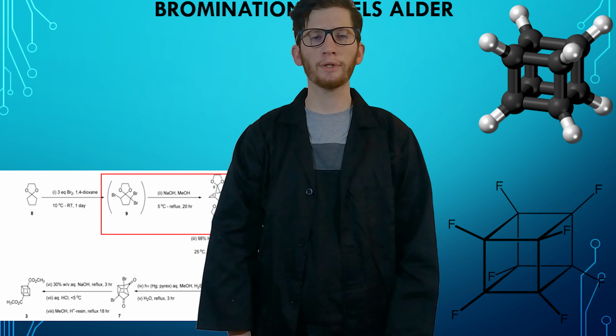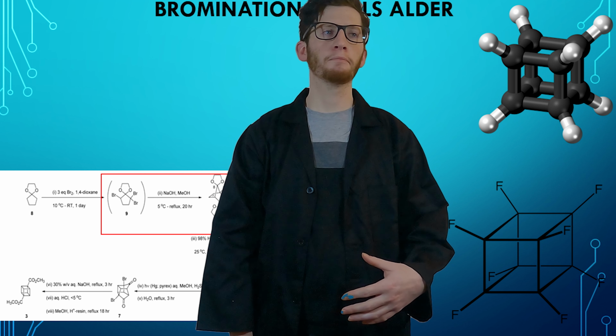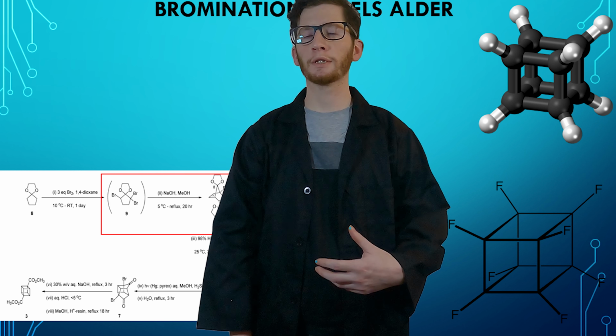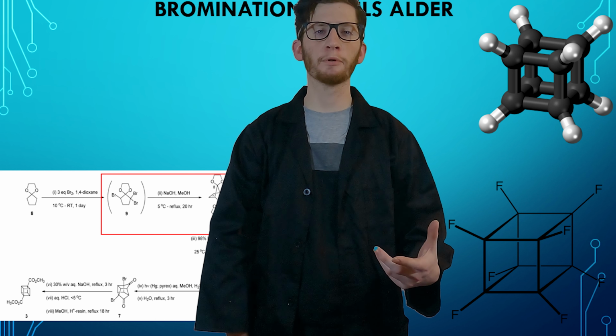So this is where we're going to deviate from publicly available synthesis, the information that's currently out there, what other people are doing. We're going to be deviating from that. We're actually going to be doing the bromination and Diels-Alder step in one. However, it is a 40-hour procedure.